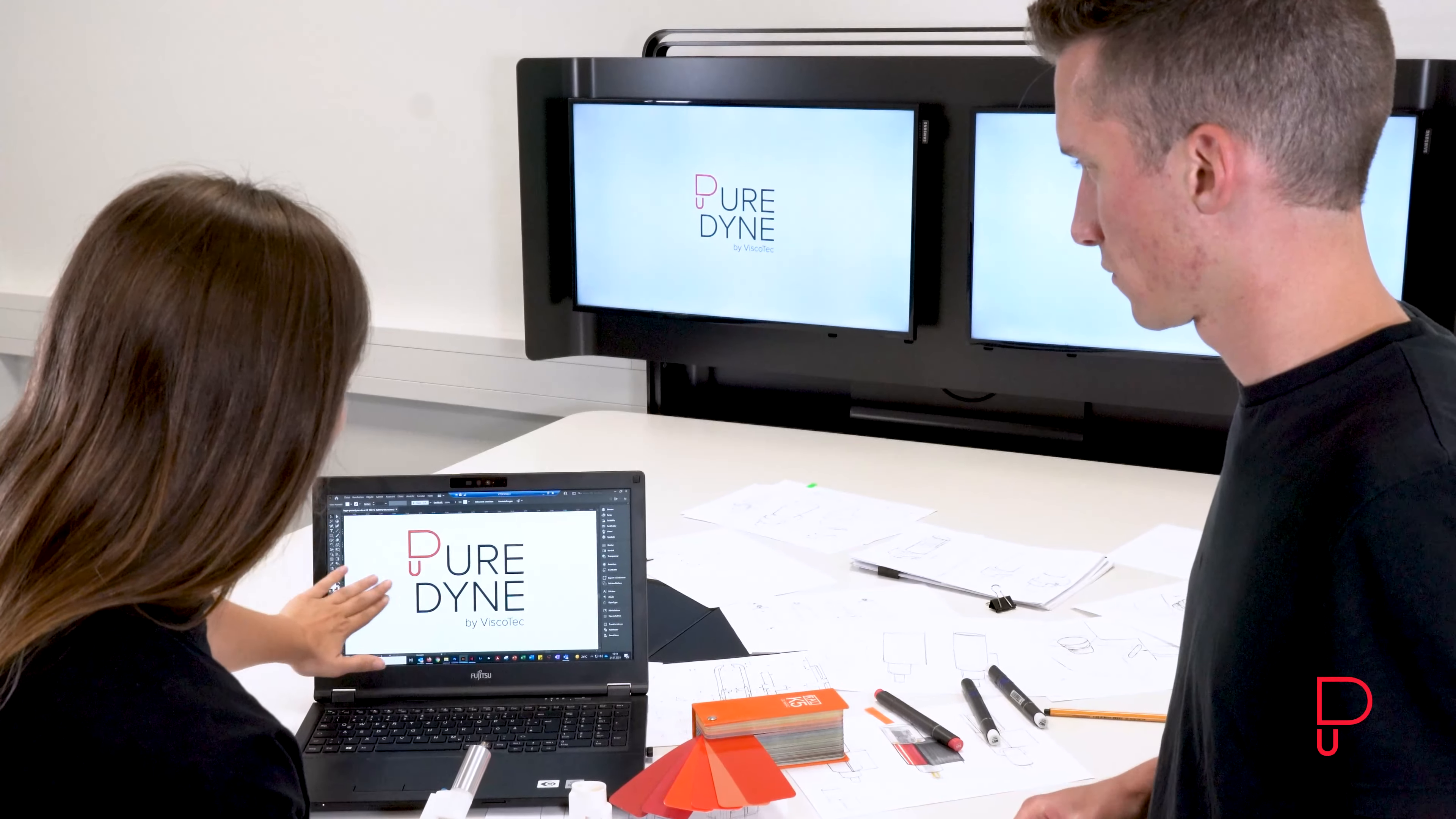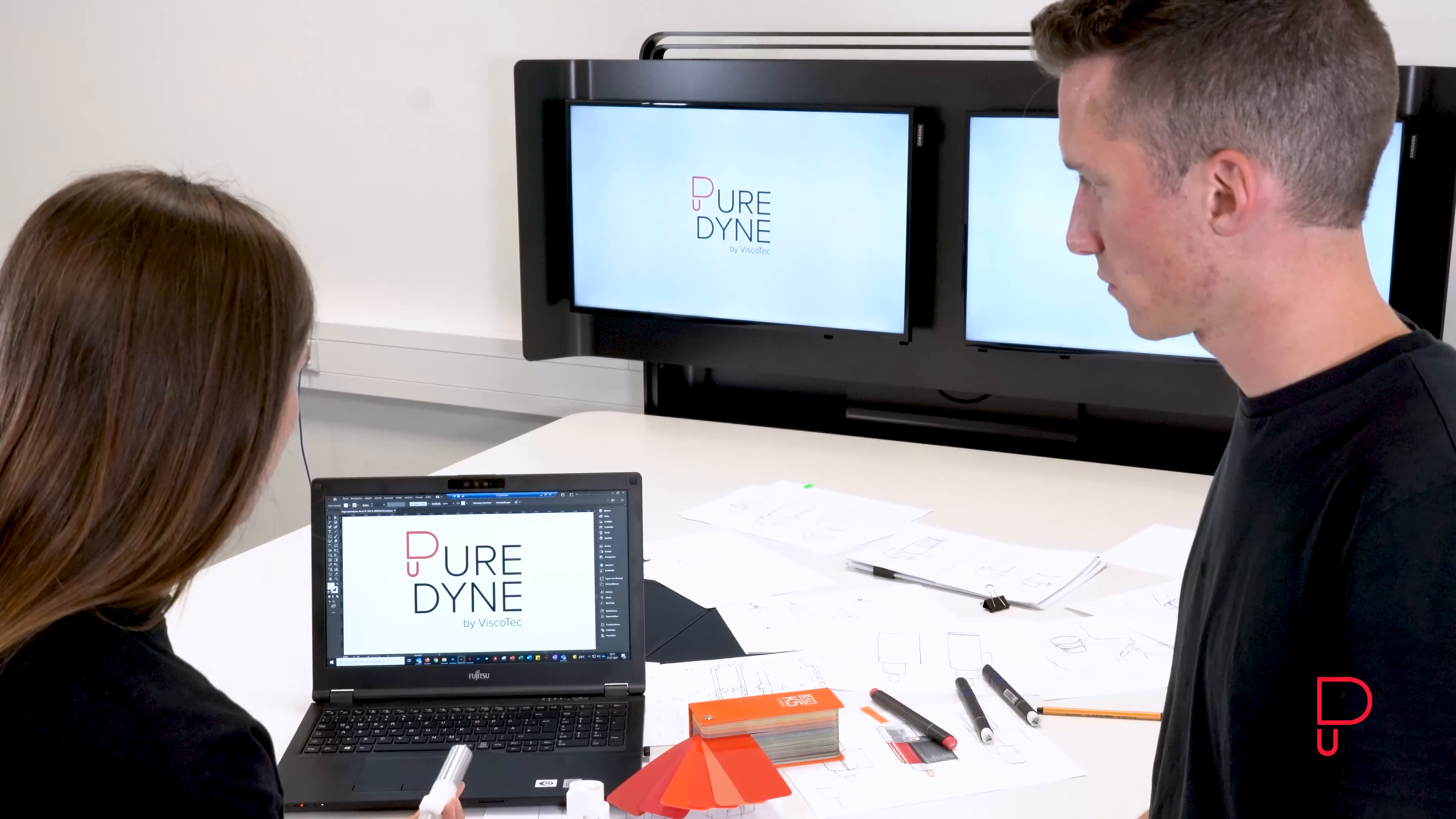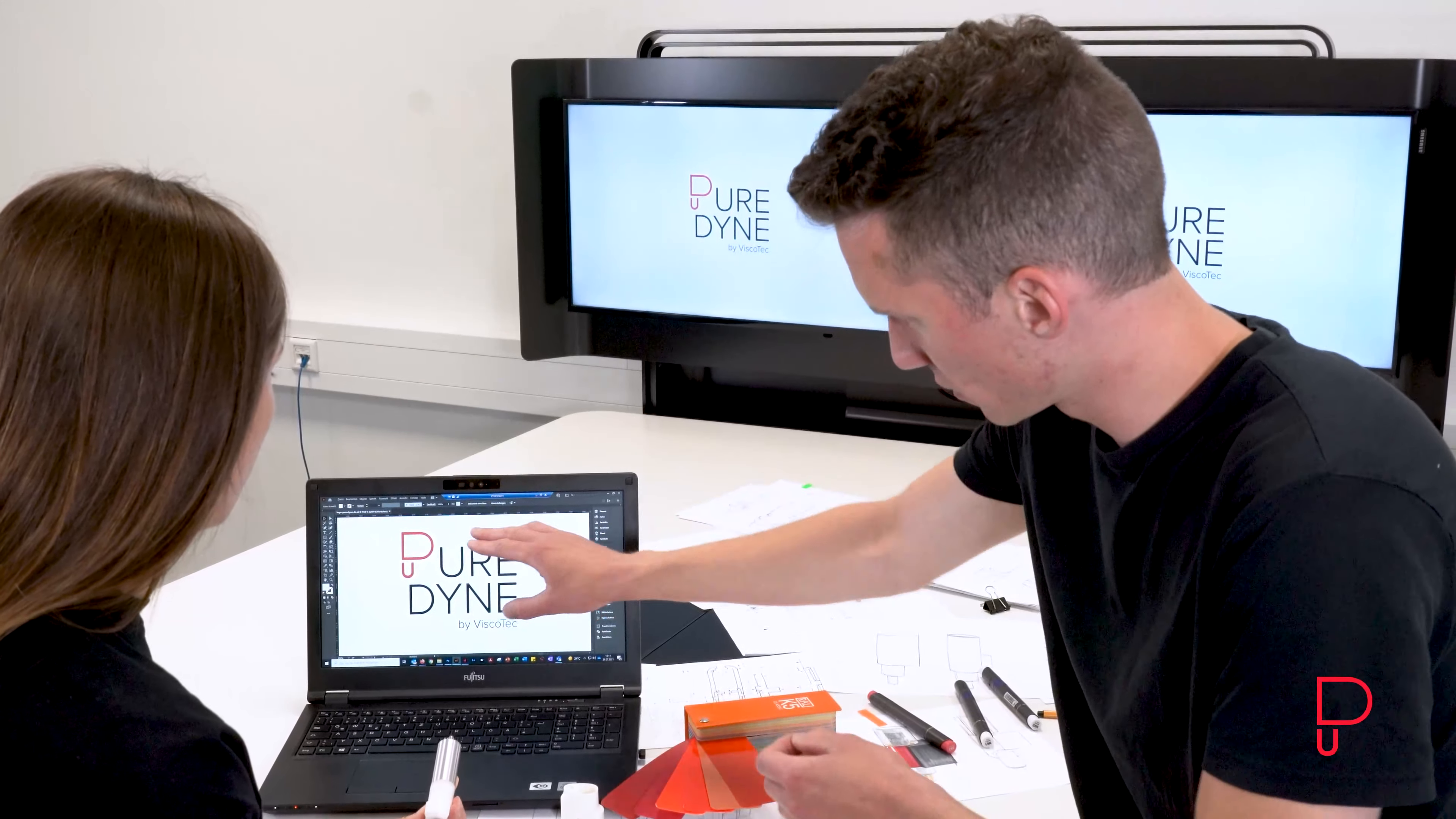All products are based on the progressive cavity pump technology. The innovative feature is the combination with a single-use cartridge. The advantages of both technologies provide the required dispensing precision for various applications and guarantee a continuous and reliable process.